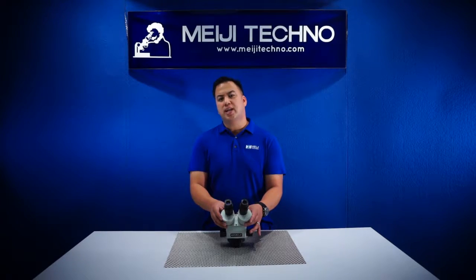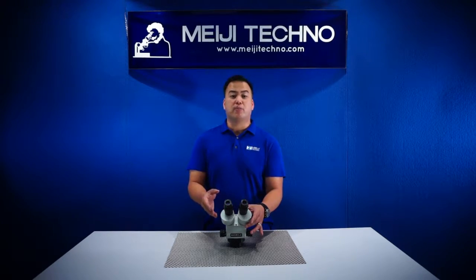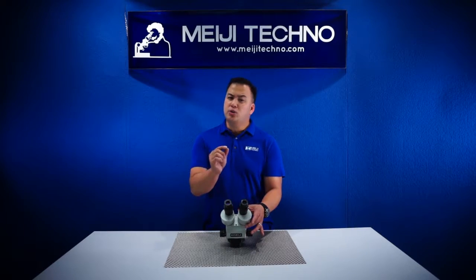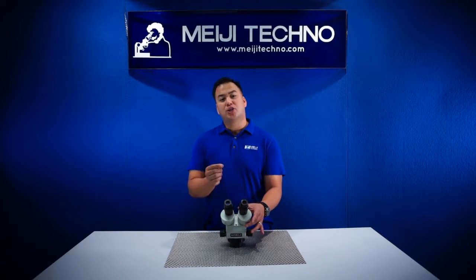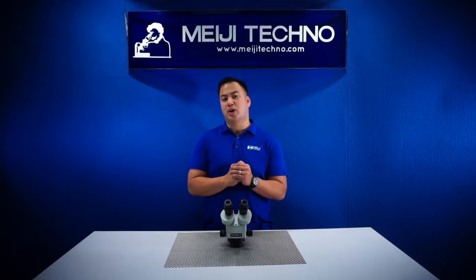With an optional auxiliary lens, working distance can be changed from 32 millimeters to 230 millimeters. This is a perfect model for specimens with minute details such as entomology, botany, or even looking at small medical device components due to its high zoom magnification range.